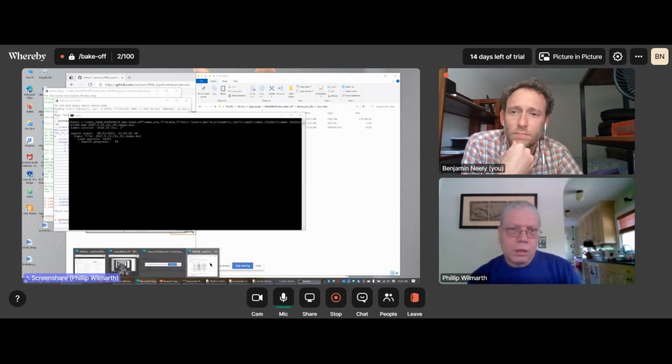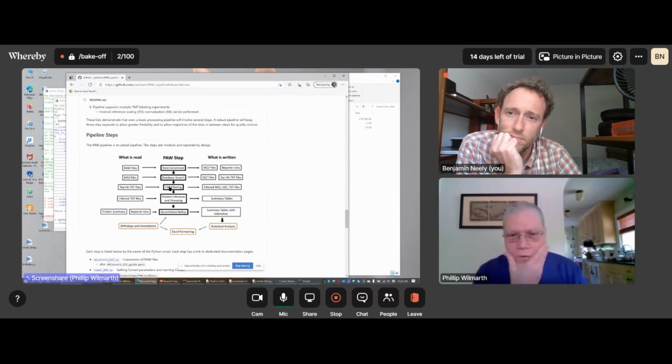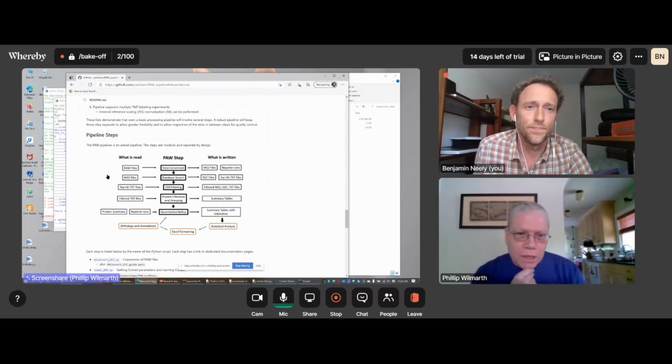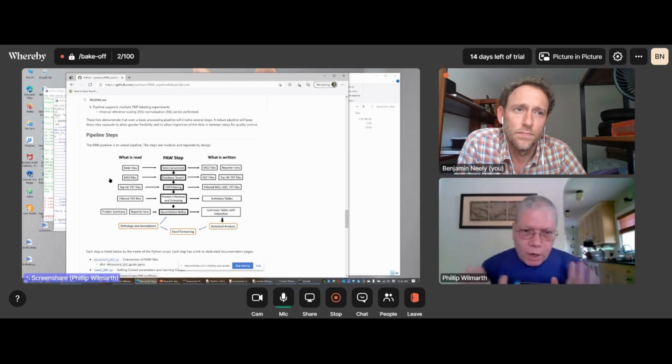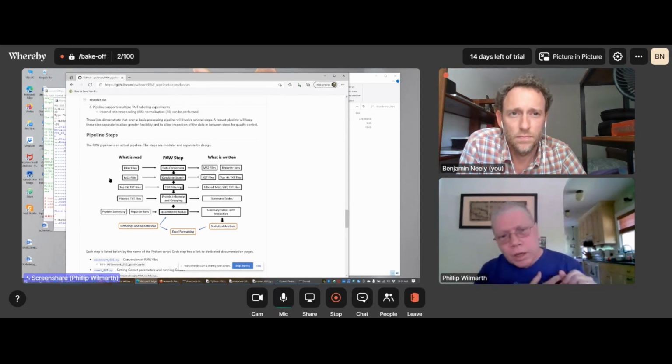Okay, so we've made the conversion step, we're doing the database search. One of the things that's kind of interesting about Comet: Comet is the open source version of Sequest written by Jimmy Eng, and it's available and maintained by the University of Washington. And Sequest, when it originally started, when it had PTMs, they were specified with special symbols. So the first PTM you specify would get an asterisk, the second PTM would get a pound sign.